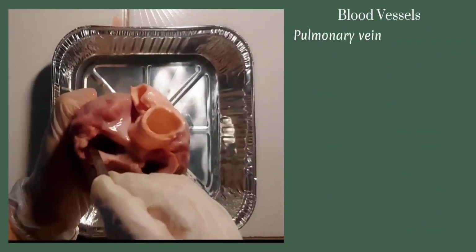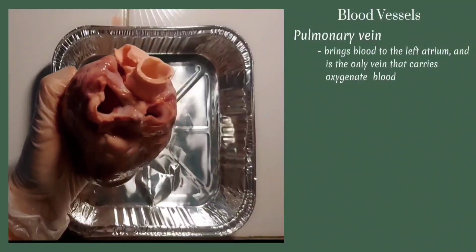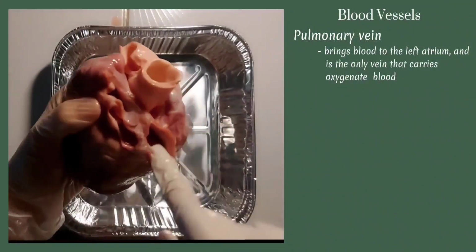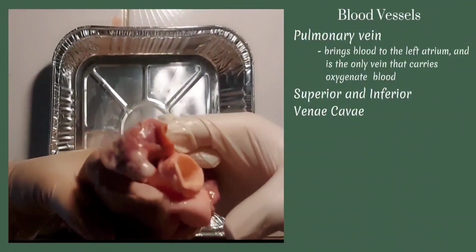This is the pulmonary vein. It brings blood to the left atrium and it is the only vein that carries oxygenated blood that comes from the lungs. When you flip the heart over to the posterior side, you'll see the superior and inferior vena cava. The superior vena cava leads directly to the right atrium.